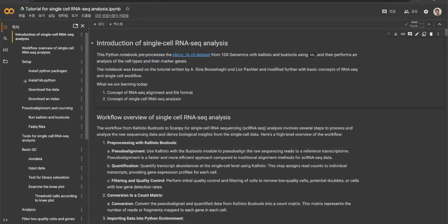Oops, I don't really like it. So let's use the draw. Is this working? Pre-processing? No.